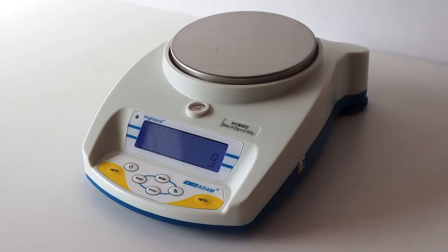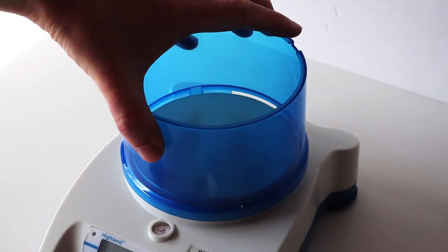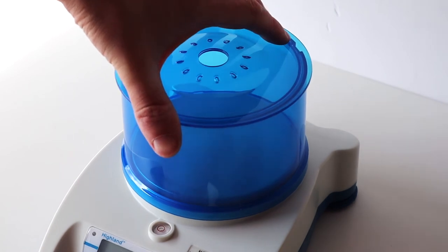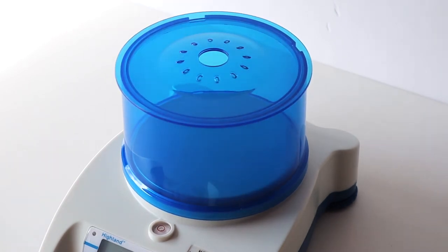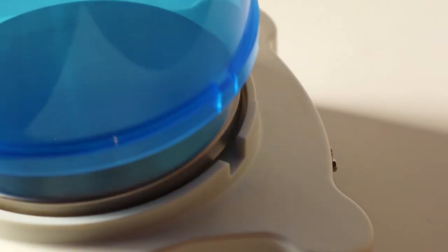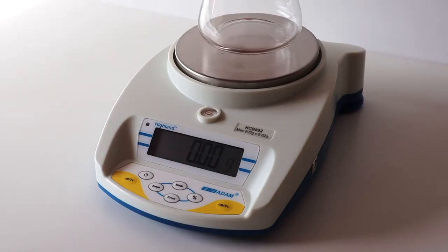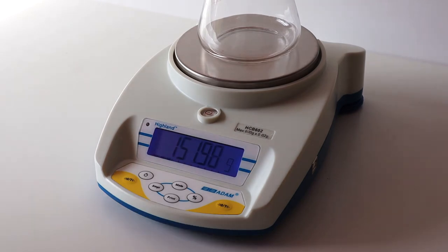You can use the Highland with or without the DraftShield, bearing in mind that the higher the accuracy of the balance, the more it will be affected by the slightest breeze. The DraftShield will help with this. Additionally, we recommend Atom Equipment's Anti-Vibration Table to improve accuracy and reliability of weight readings when using balances.